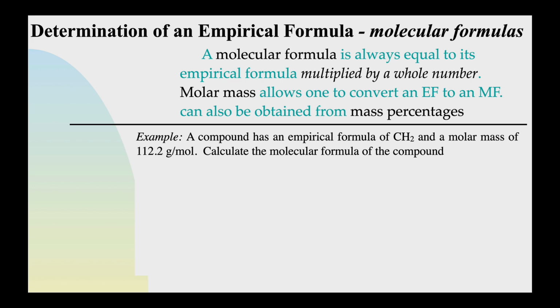But before we do that, I want to remind you that H2O2 was hydrogen peroxide, and we saw that the empirical formula was HO. So again, H2O2 would be the molecular formula, what it quote-unquote looks like in the real world, but the empirical formula is HO, 1 hydrogen to 1 oxygen. Now, the reason this is an empirical formula lab is that you can get that 1-to-1 ratio like that. You can get it from masses.